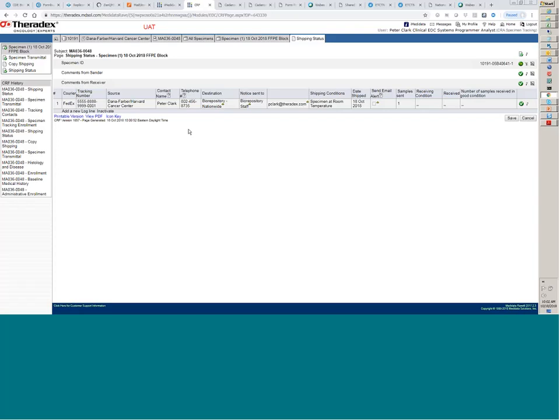But isn't there some specimen that does need to be collected right before the patient joins the study? Yes, exactly. So I just wanted to make sure that that was configured correctly, that the eligibility is based on obtaining a specimen rather than any review of the specimen. Excellent.